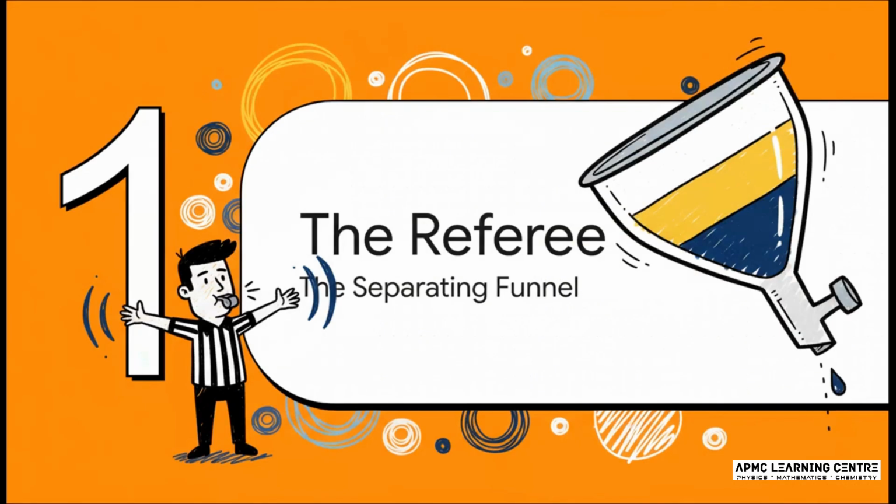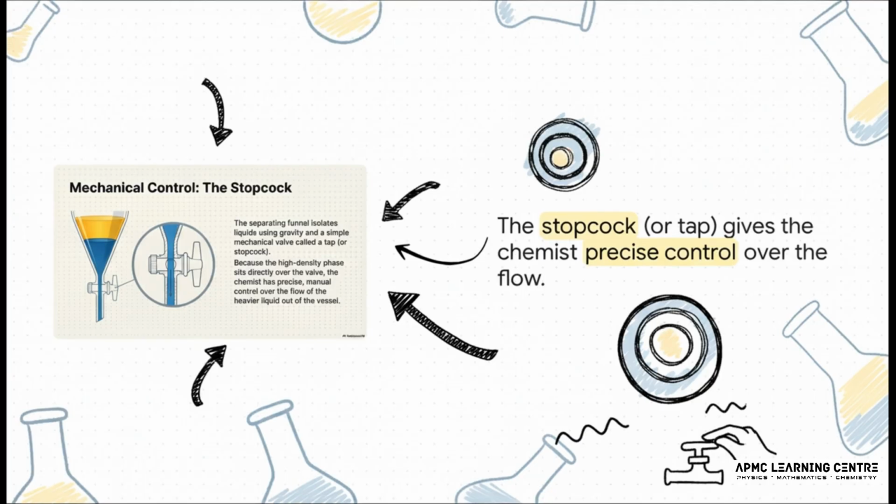This is a basic rule of physics, and it's the secret sauce that makes this whole separation thing possible. Okay, so if density is the rule of the game, who's the referee that enforces it? Well, let me introduce you to the perfect tool for the job, the separating funnel. You know, the real genius of this thing is how simple it is. The absolute key part is this little valve down at the bottom. It's called a stopcock. Because that heavier, denser liquid naturally settles right on top of it, this one little tap gives the chemist complete, and I mean precise, control. You can literally drain that bottom layer one drop at a time if you want. It is all about control.